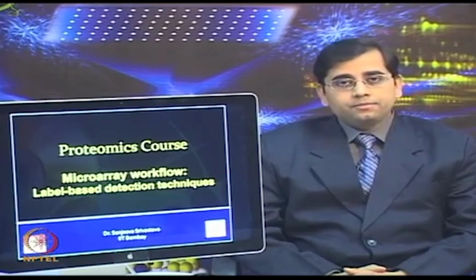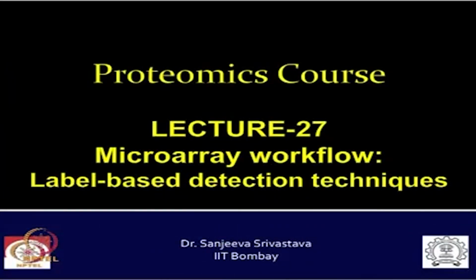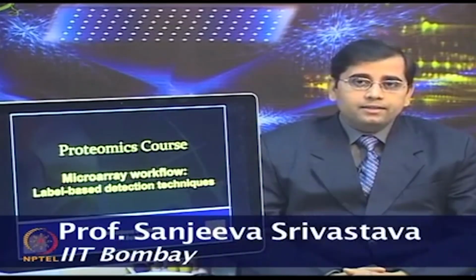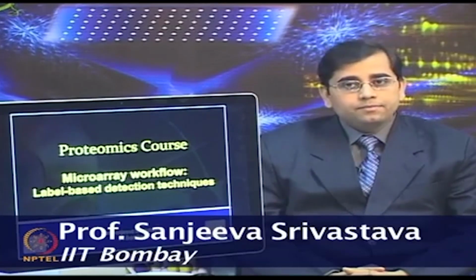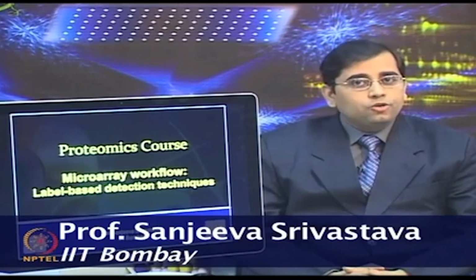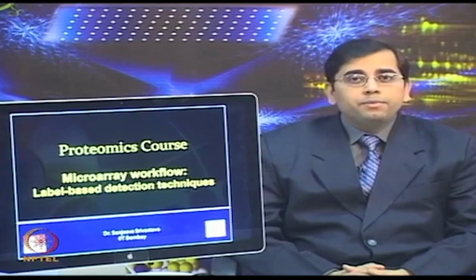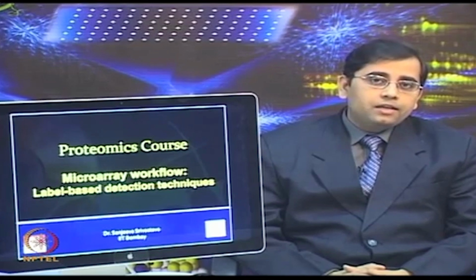In today's lecture, we will continue our discussion on microarrays workflow. We will talk about label based detection techniques. Most of the microarray applications to date have used label based detection techniques due to their several advantages such as ease of use, common availability of reagents and simple instrumentations which are required for detection of these label based systems.